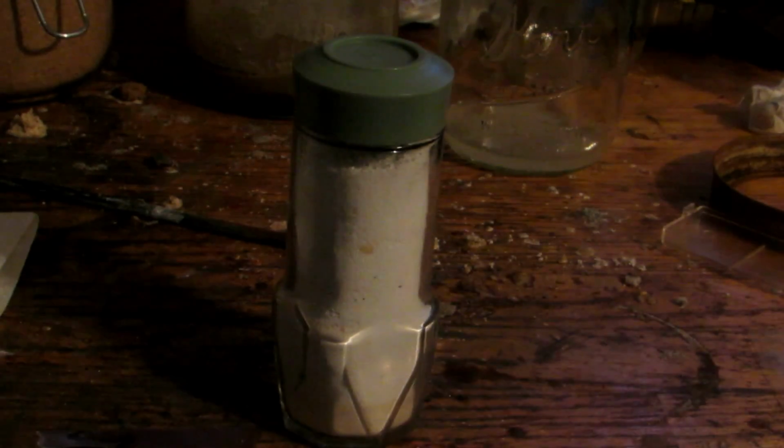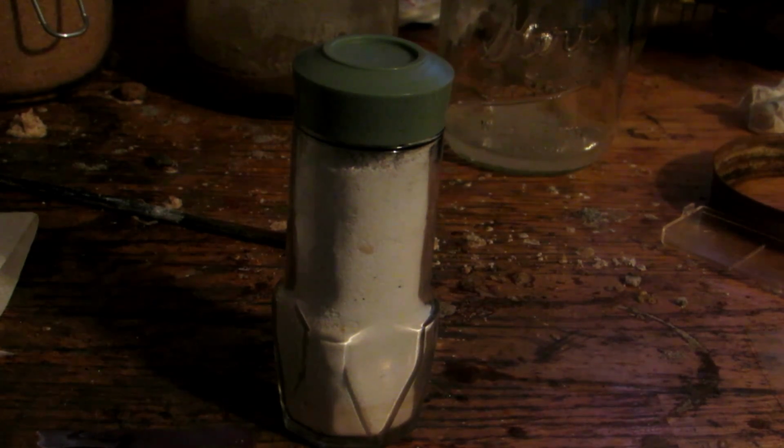And some things that we'll be using this for is to make silicon metal, or well, it's a metalloid, but elemental silicon, through the reduction with aluminum. And I also plan on reacting this with sodium hydroxide, making sodium silicate, so that we can do a reaction known as a chemical garden, which is where you drop transition metal salts into a solution of sodium silicate, and very cool things happen as the insoluble metal silicates precipitate out.